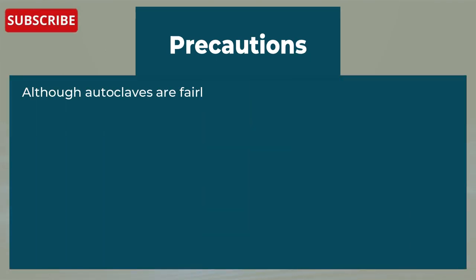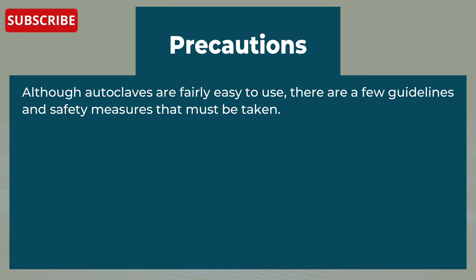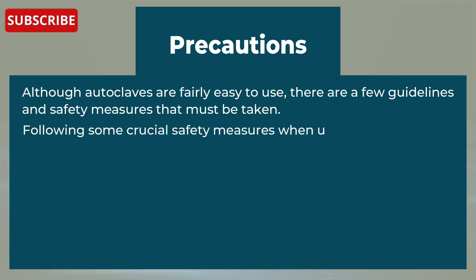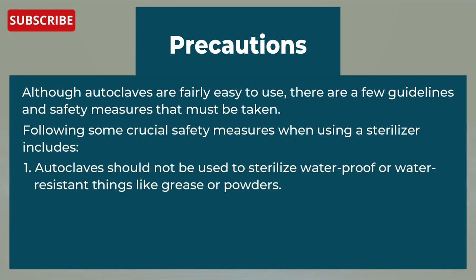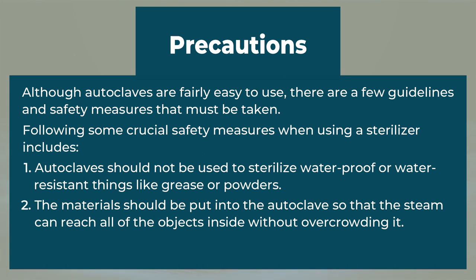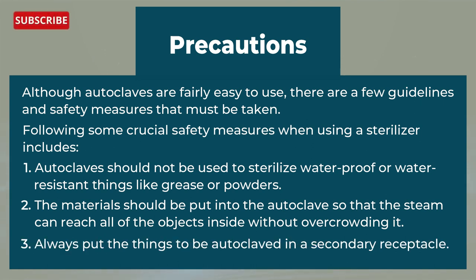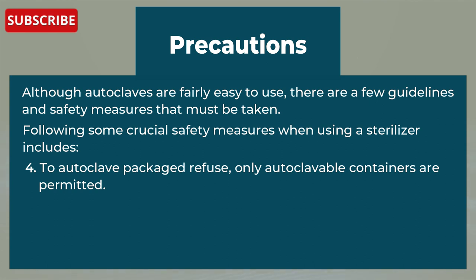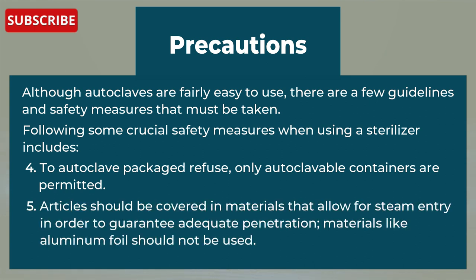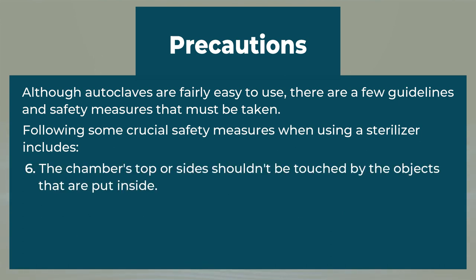Now let's see the precautions. Although autoclaves are fairly easy to use, there are guidelines and safety measures that must be taken. These include: First, autoclaves should not be used to sterilize waterproof or water-resistant things like grease or powders. Second, materials should be placed into the autoclave so that steam can reach all objects inside without overcrowding. Third, always put items to be autoclaved in a secondary receptacle. Fourth, only autoclavable containers are permitted to autoclave packaged refuse. Fifth, articles should be covered in materials that allow for steam entry to guarantee adequate penetration — materials like aluminum foil should not be used. Sixth, the chamber's top or sides should not be touched by objects placed inside.